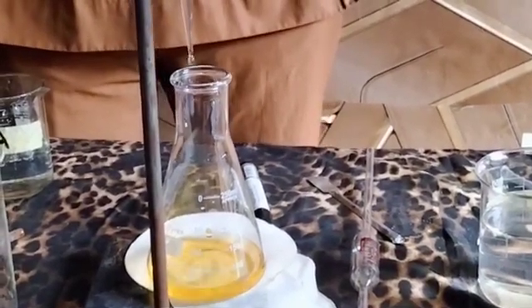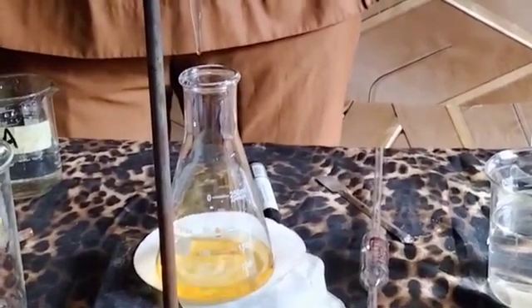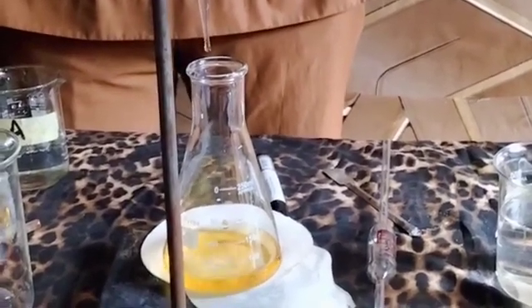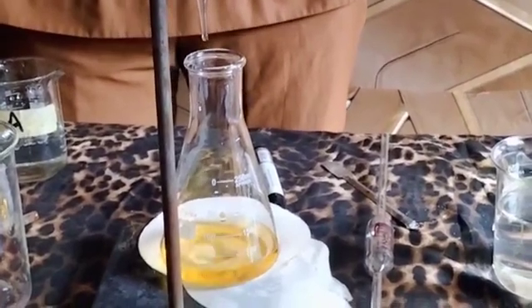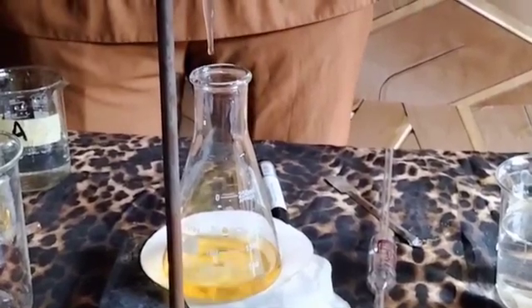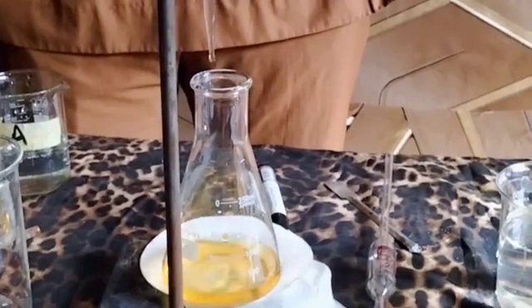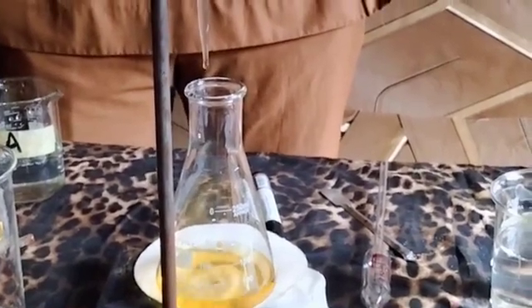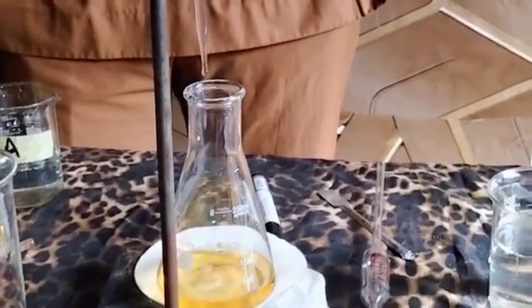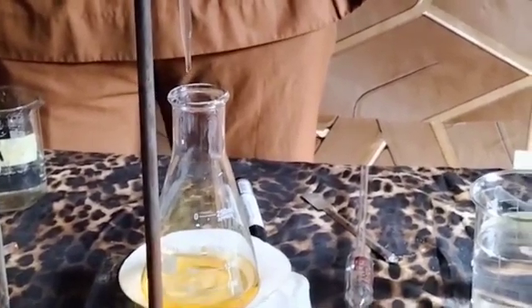The precautions for the experiment is that you make sure the burette is clamped vertically, erect. You also make sure that the burette is rinsed with the acid that you're supposed to use before the titration commences. You also make sure that the conical flask is only rinsed with distilled water. You also make sure that you only add 2 or 3 drops of indicator in the experiment. Because indicators, as I said, are solutions of organic acids and organic bases or dyes. So if you add plenty amount of the indicator, you're going to affect the end point.